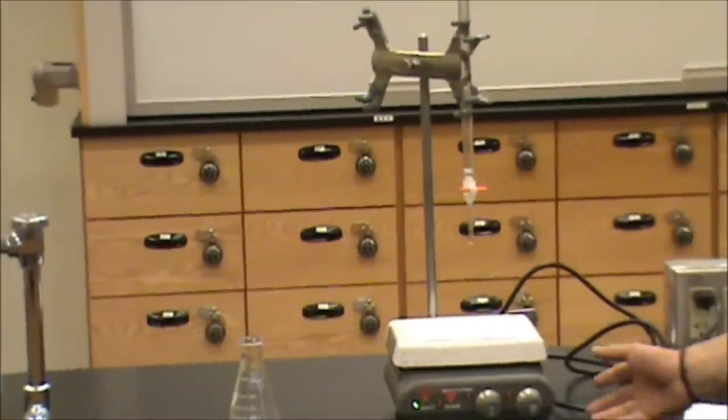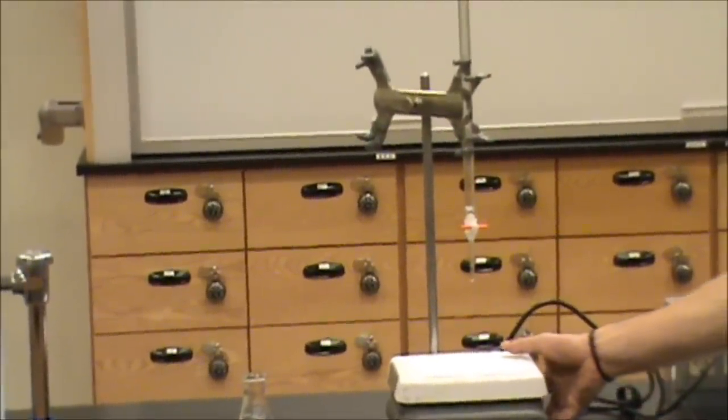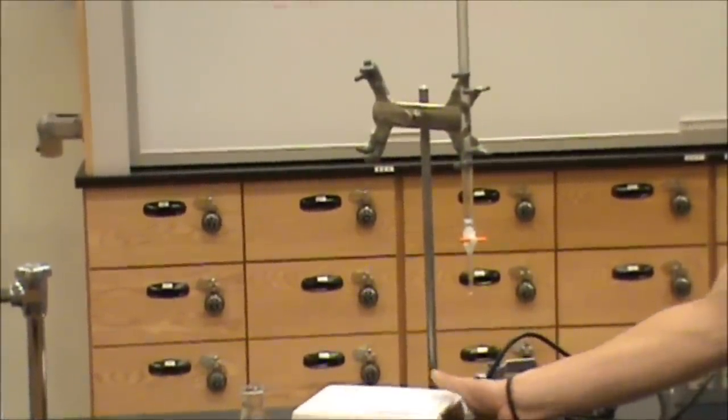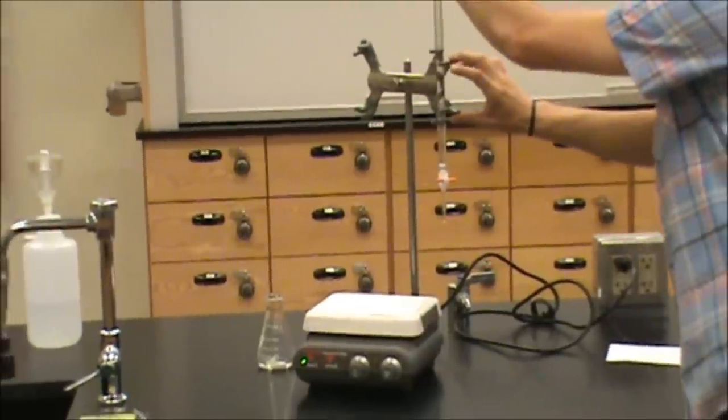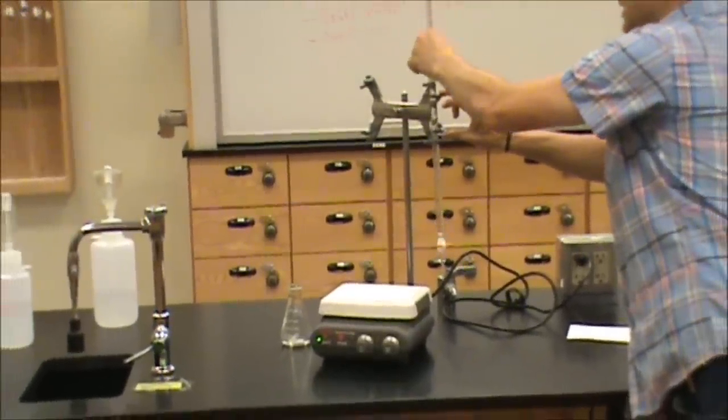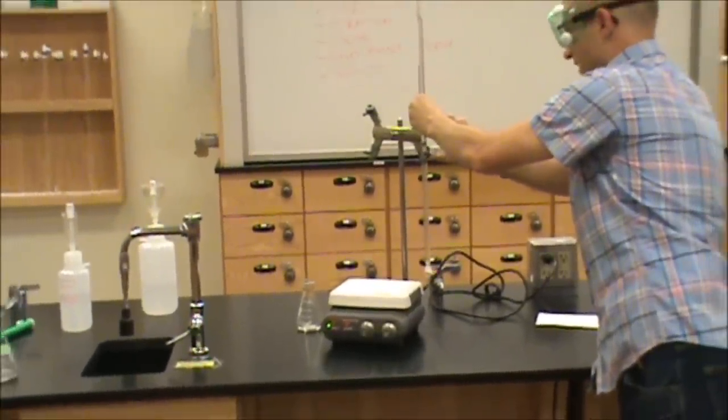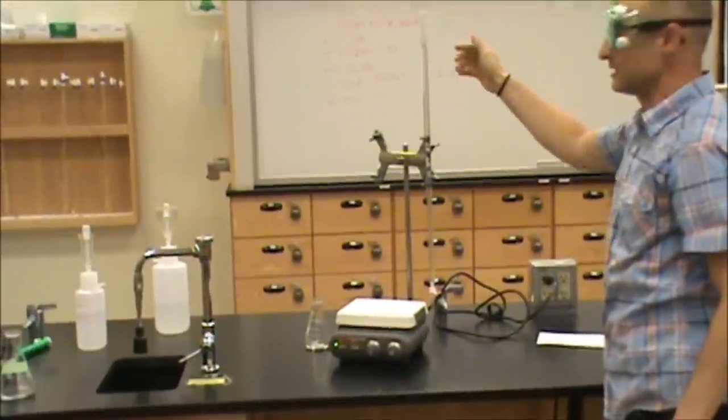Before we begin, we have to record the initial volume in the burette. Perhaps the easiest way to do this is to gently release the clamp and slide the burette downwards to a level where you can easily see the fluid.